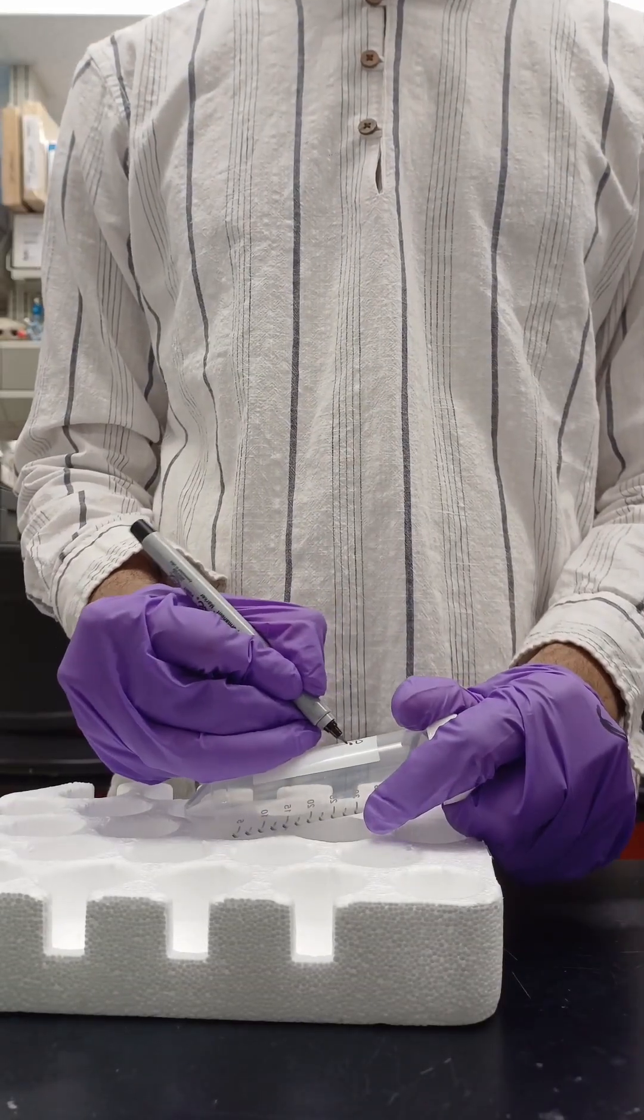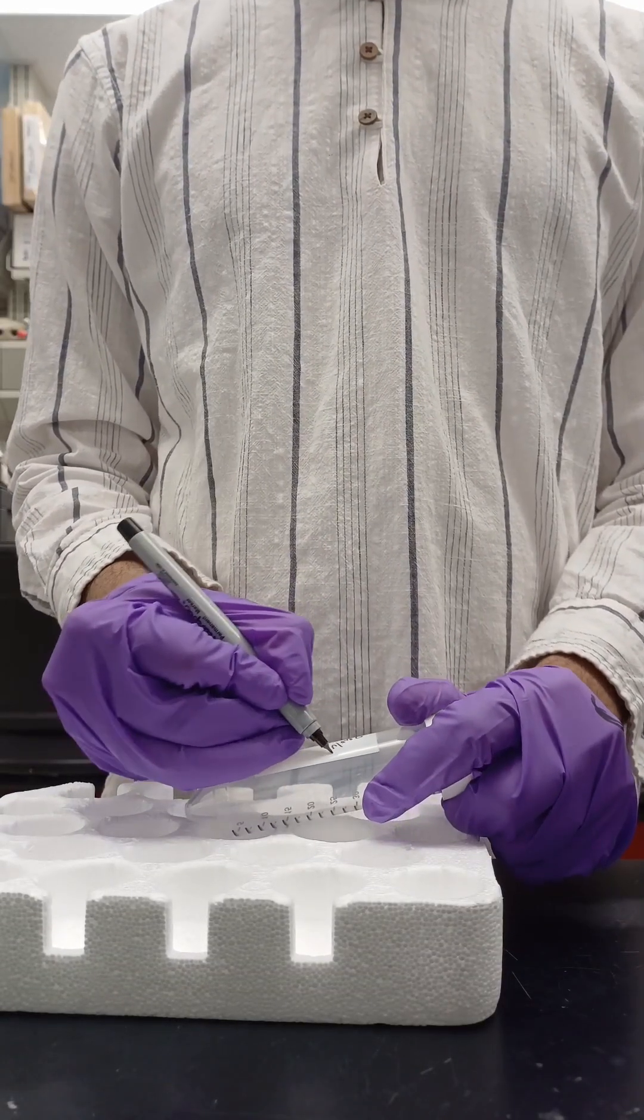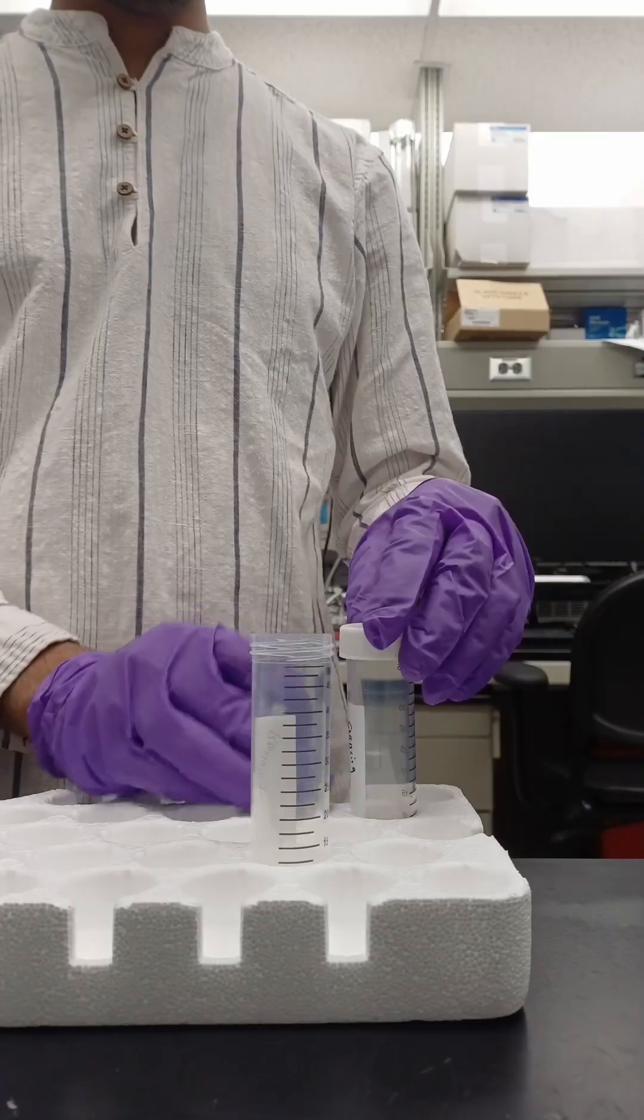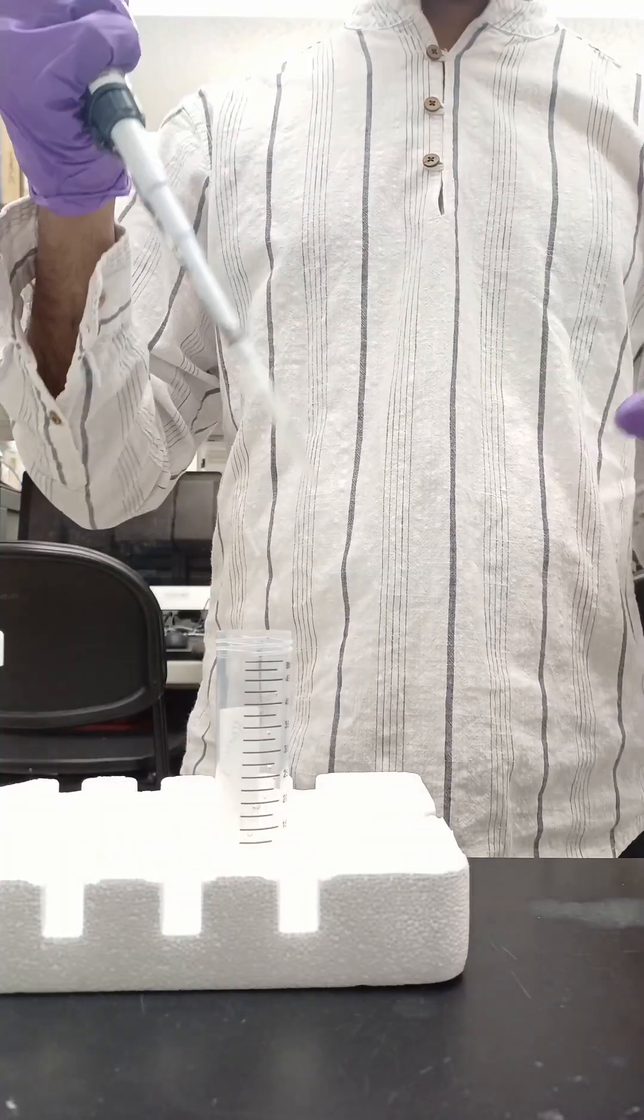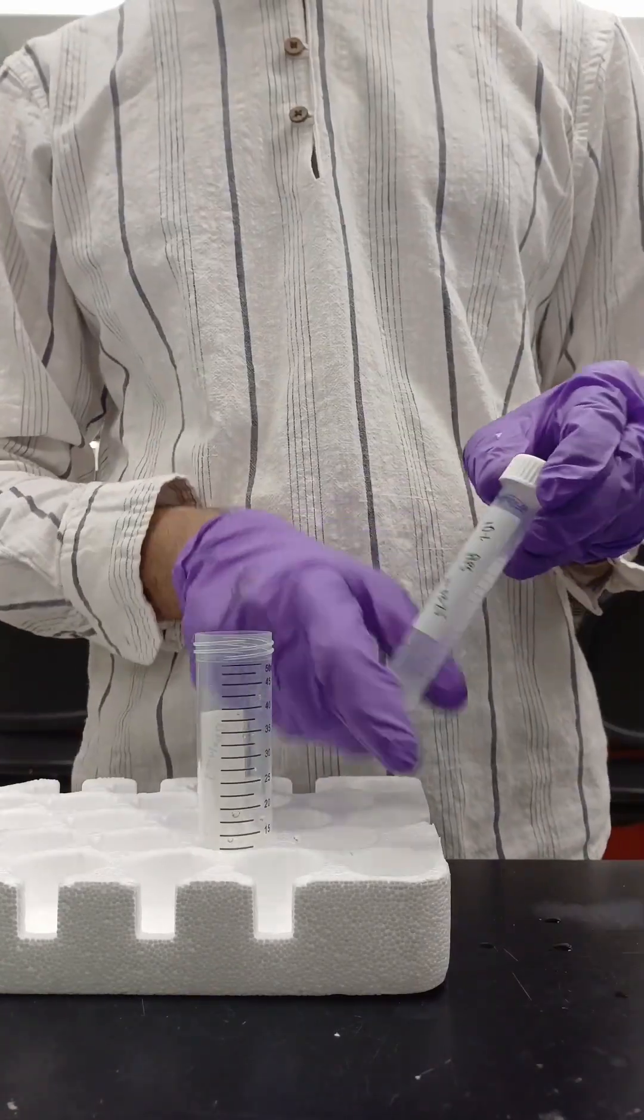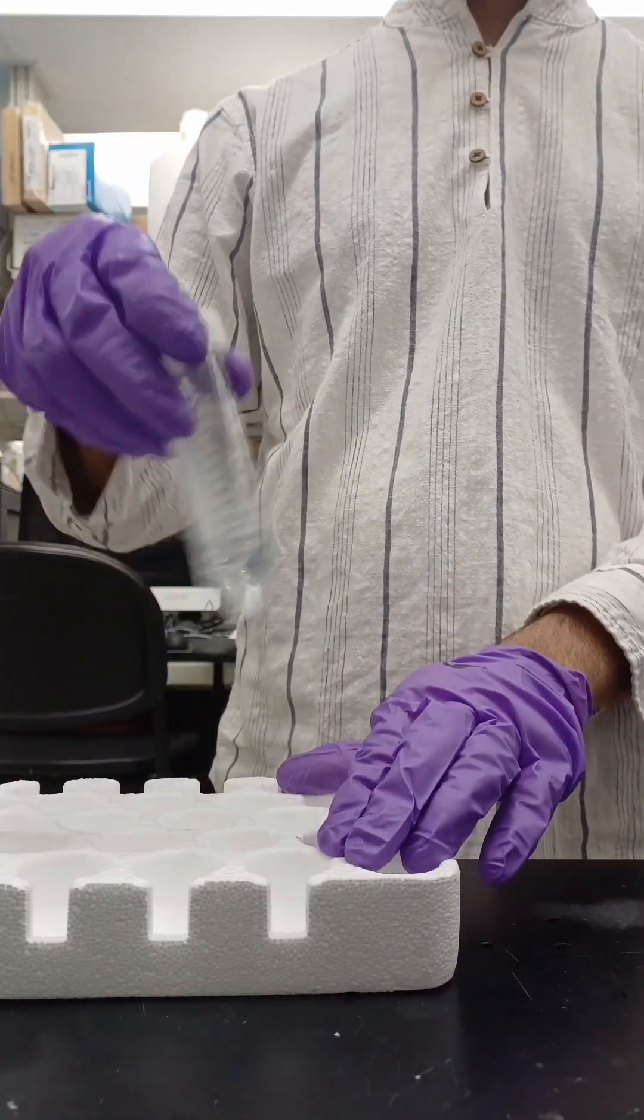While that's sitting, quickly prepare resolving gel. Always add ingredients from highest to lowest volume. Usually, water comes first, then acrylamide tris with pH 8.8, 10% SDS, 10% APS and lastly TEMED. Mix them well.